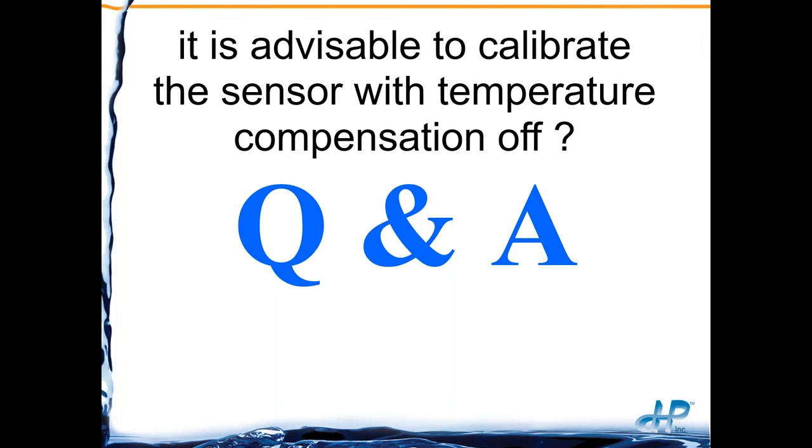Next question is, is it advisable to calibrate the sensor with temperature compensation off? Absolutely not. 2 reasons, because your glass electrode, you take it out of a process that's running 80, 90 degrees Fahrenheit, and you stick it in a buffer solution that's been room temperature, or it could be even further extremes than that. If you have that temperature compensation off, you're building in errors because your sensor is not compensating for that expansion and contraction of the glass electrode. So you always need to have that ATC, the automatic temperature compensation, on.